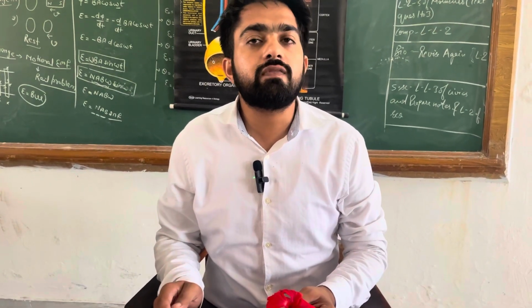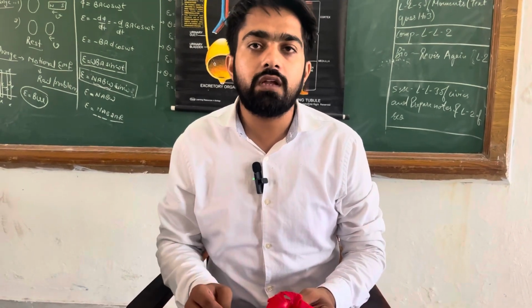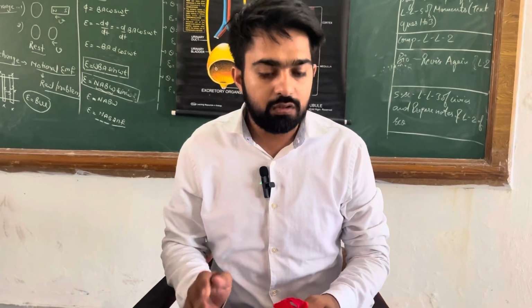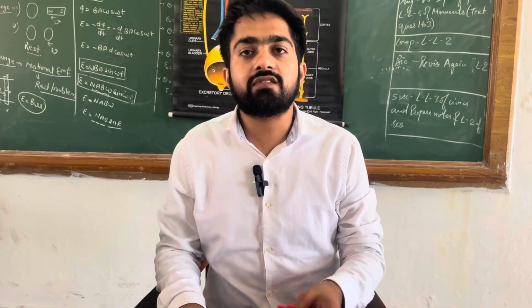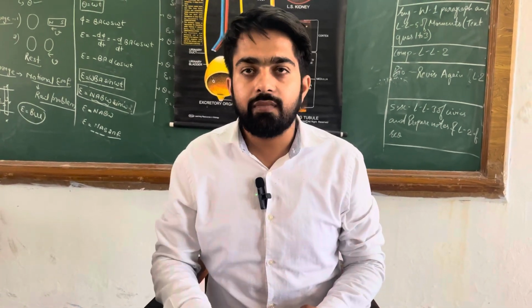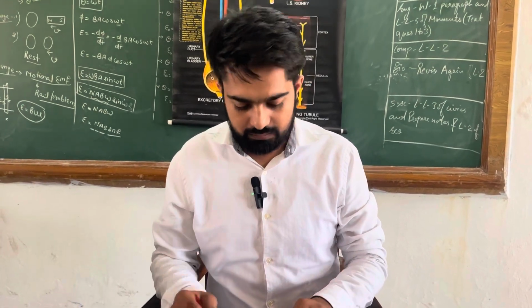And what are unisexual flowers? Those which consist of stamen only or pistil only can be considered unisexual flowers. So let's start. Before starting this, first of all, we have a China rose, a forceps and a needle. So let's start with the experiment.